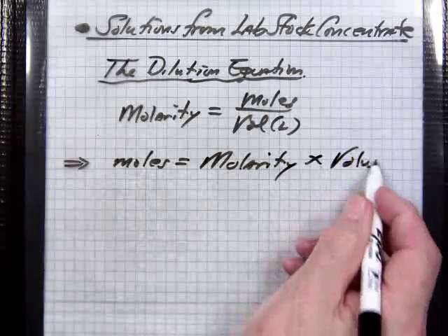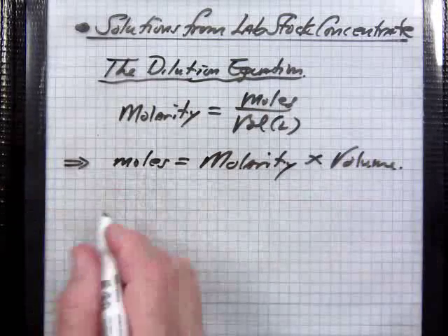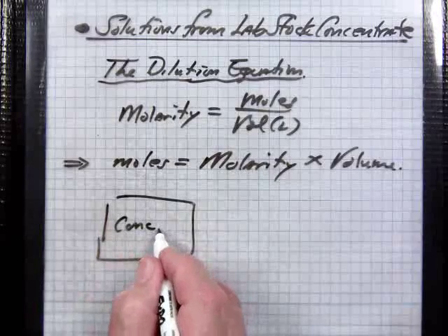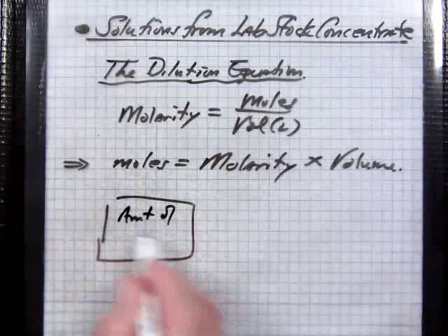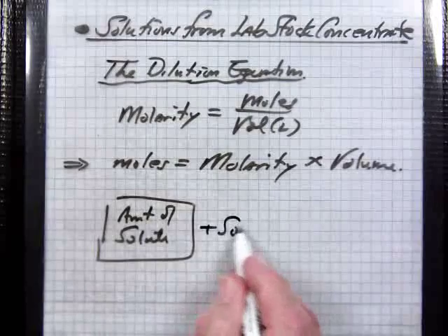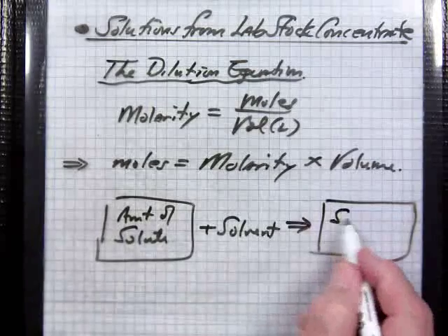Okay. Now, in making a solution, you start out with an amount of solute, and then you add solvent, and this gives you the solution.